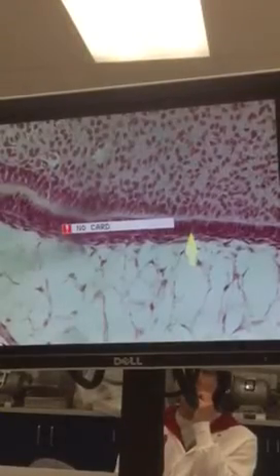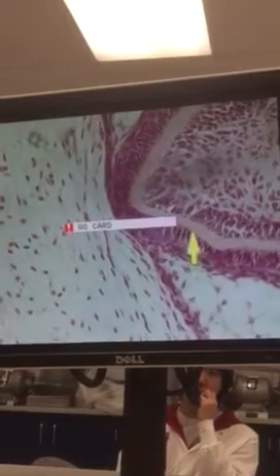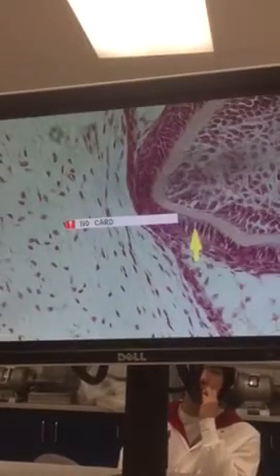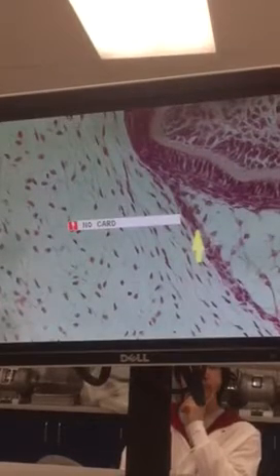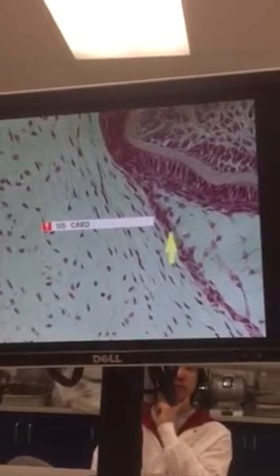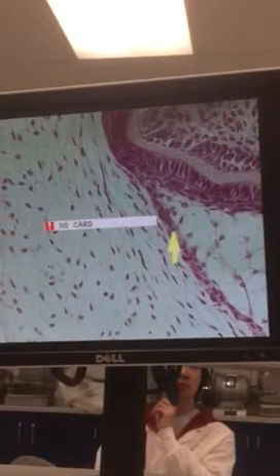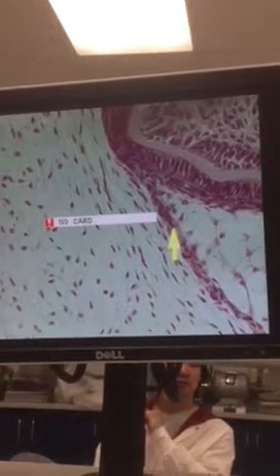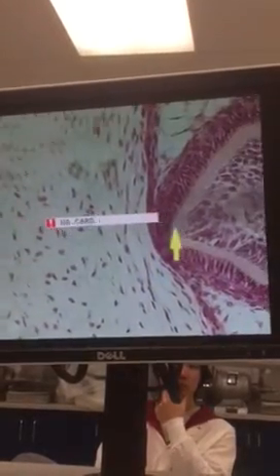We've got morphogenic stage. And as we come up here, we have some dentin, predentin. We have organizing stage. And then right here, you can see where that reduced enamel epithelium is forming from the outer enamel epithelium, stellate reticulum, stratum intermedium, all coming down together to lay on top of the ameloblasts.